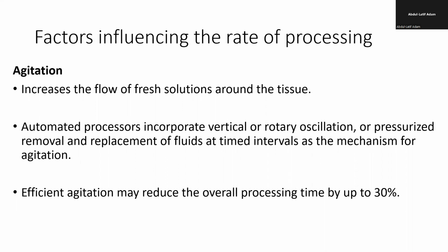Okay, great. So when there is agitation, there is increased penetration, and it can reduce the processing time by about 30%. Okay. So if you do the manual processing, there is no automatic agitation, so you will have to go there and move the basket yourself.